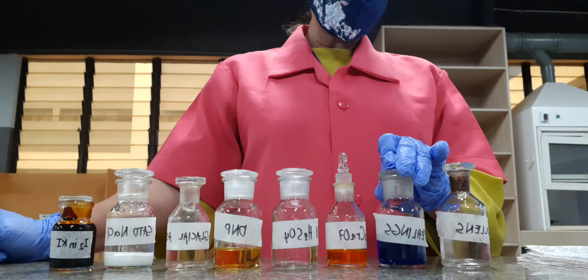We are using potassium dichromate, just like what we have discussed in our lecture. We make use of potassium dichromate, which is orange in color, and you remember that in your alcohols and phenols, we have the oxidation of alcohols, primary alcohols and secondary alcohols.